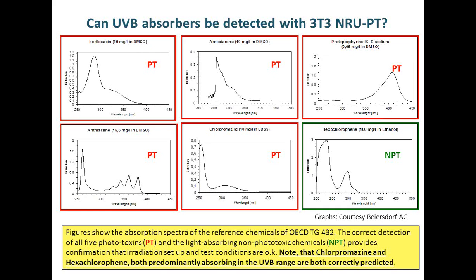But what some people do not understand is that we used a lamp filtered with a cutoff of 320 nanometers, and at 320 nanometers we still had a transmission of 50%. Then, depending on the steepness of the transmission curve of your filter, and on the irradiance above the filter, a certain amount of UVB is still present in your light. This is a little amount of UVB, but quite significant and good enough for stimulating UVB absorbers if they are not exclusively UVB.